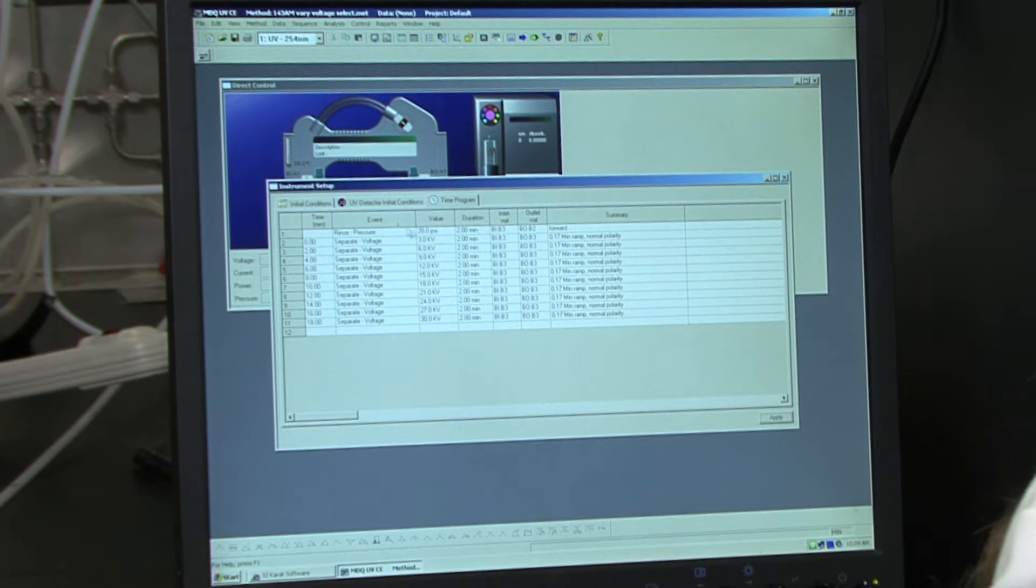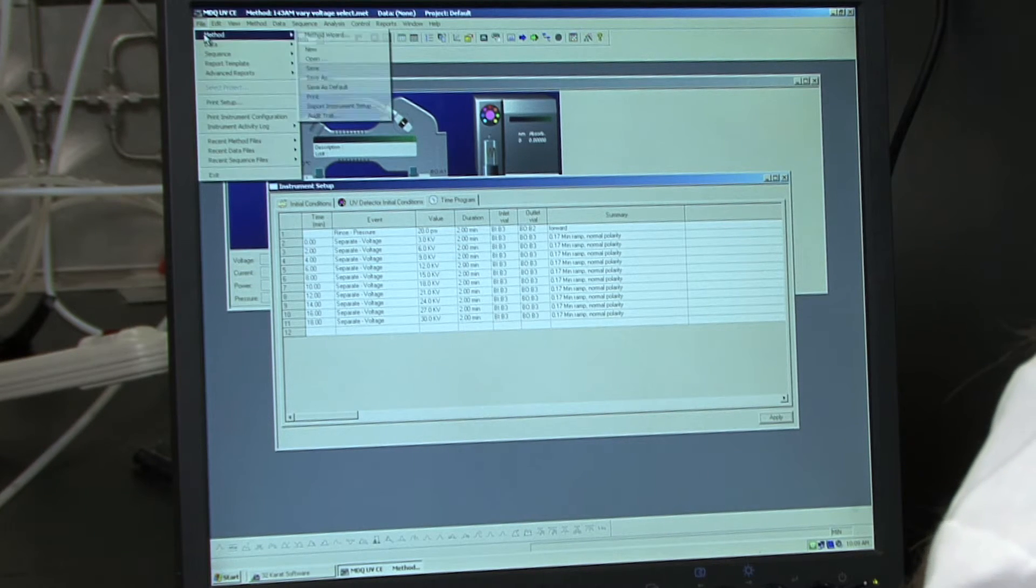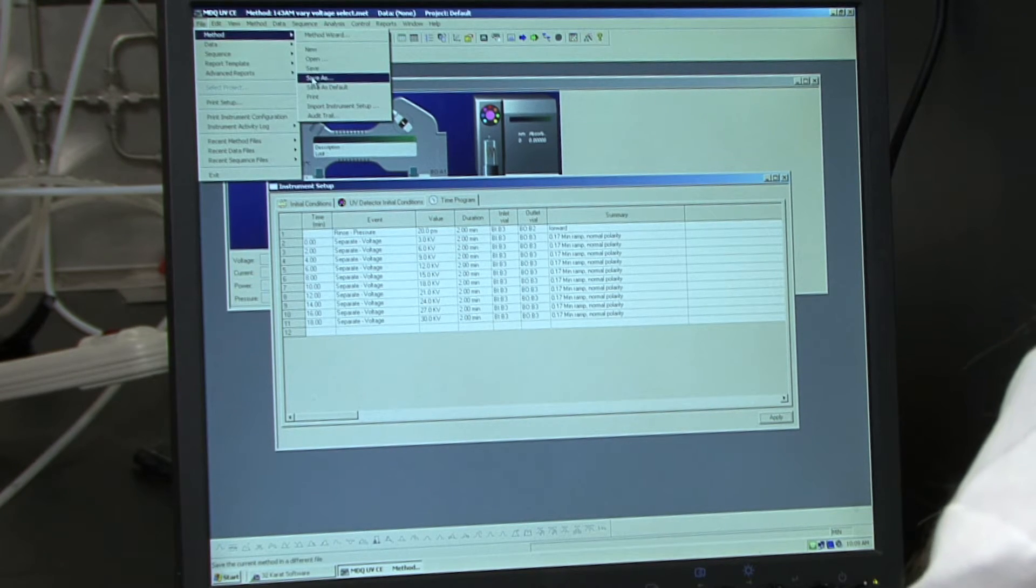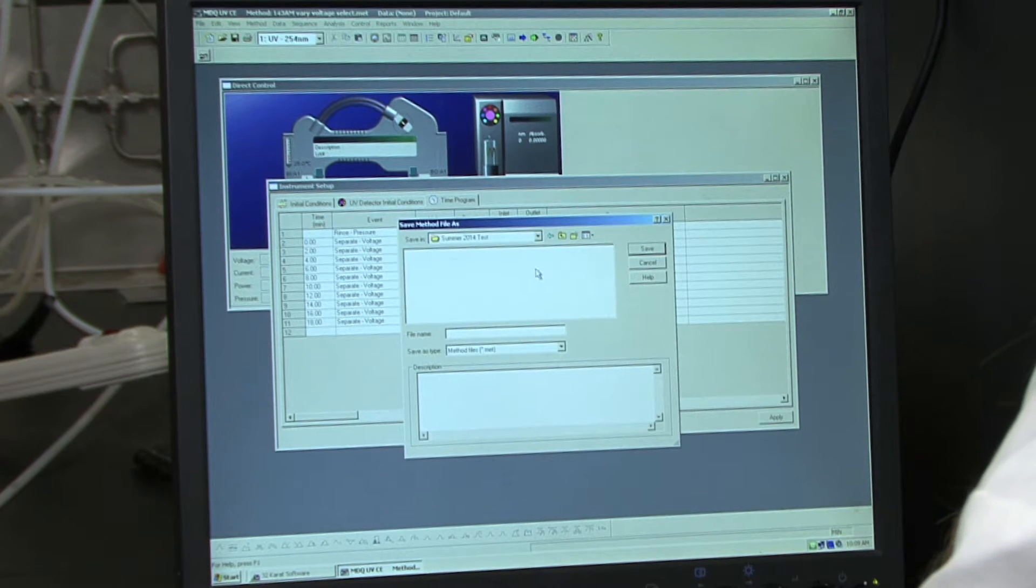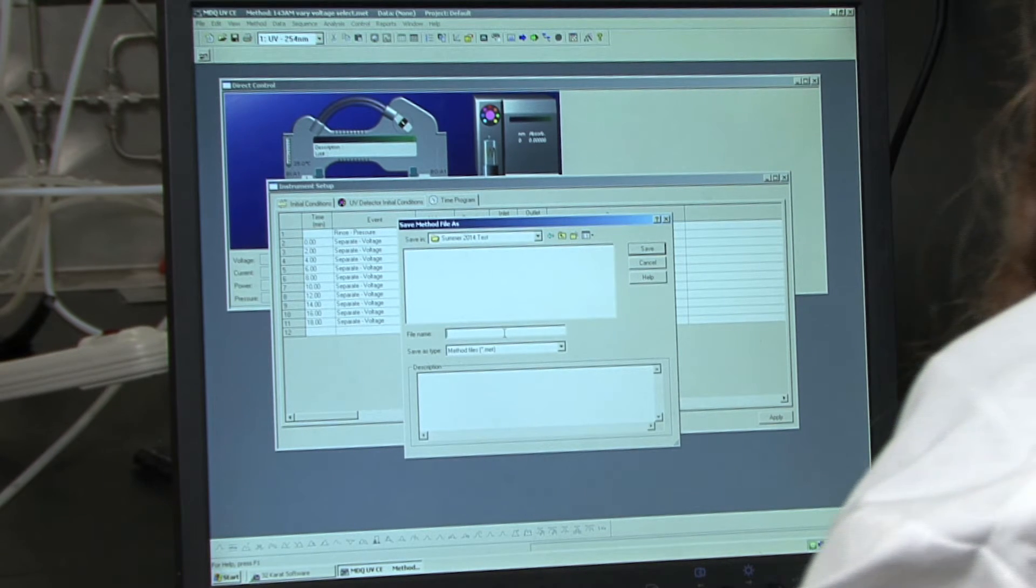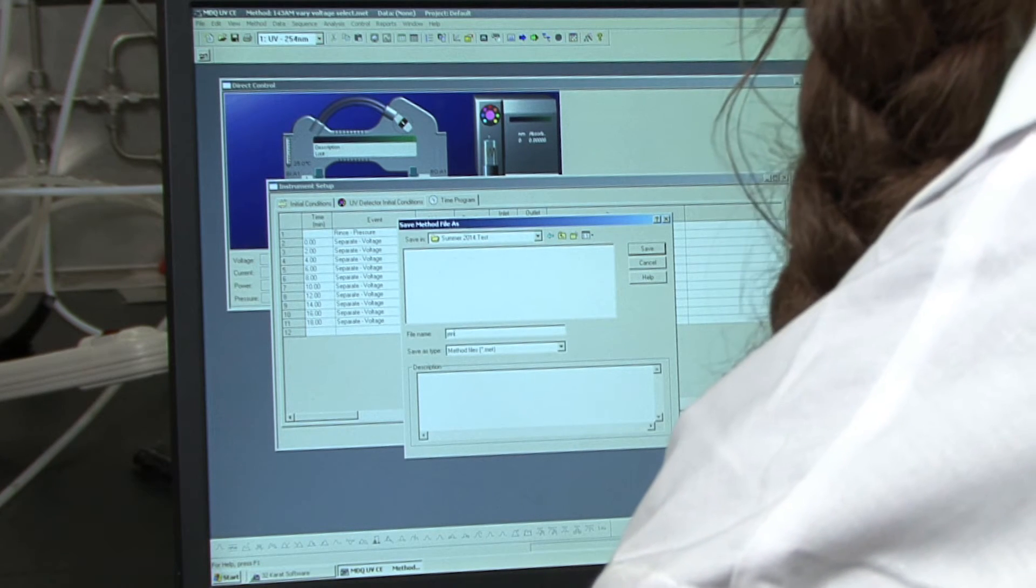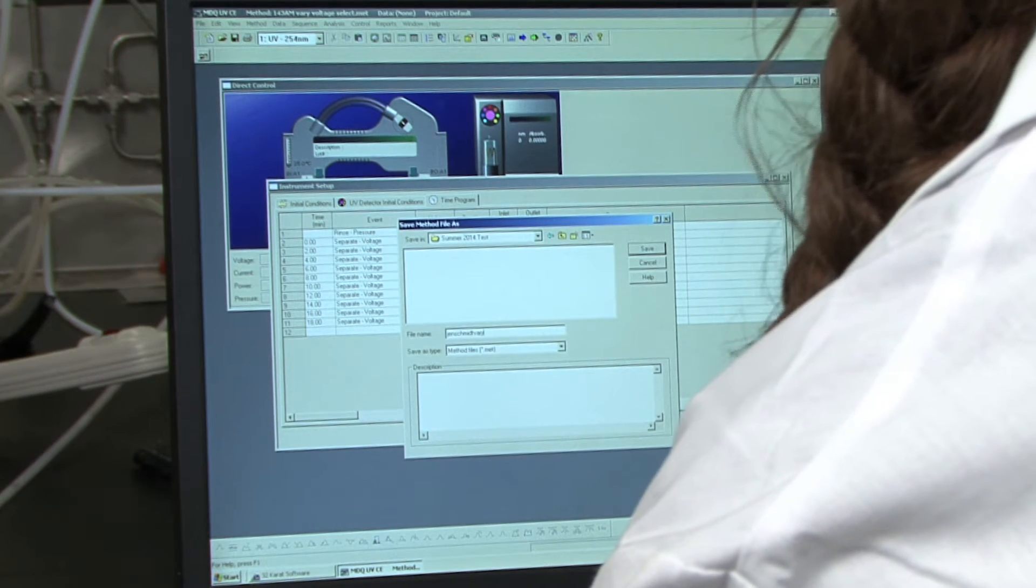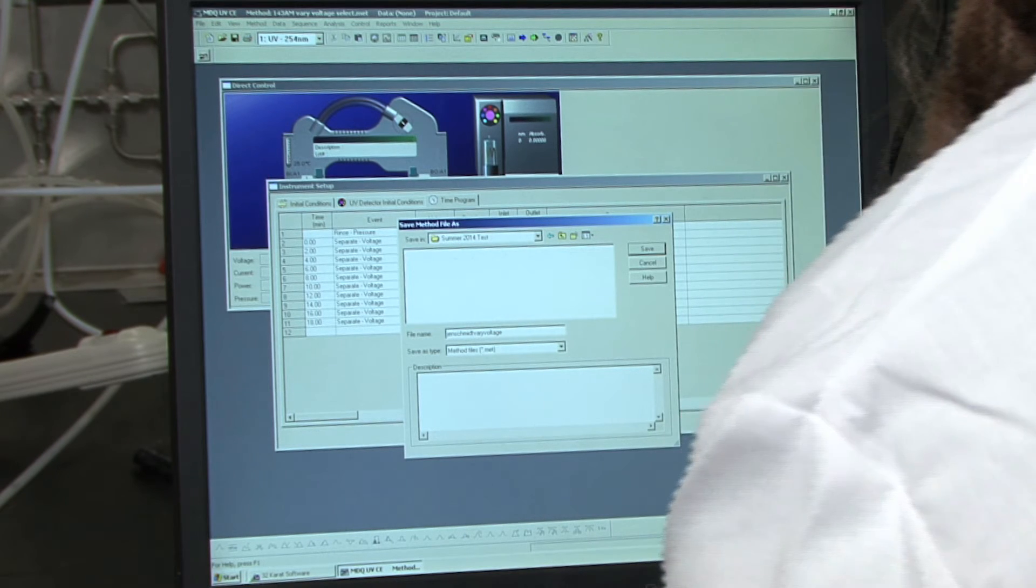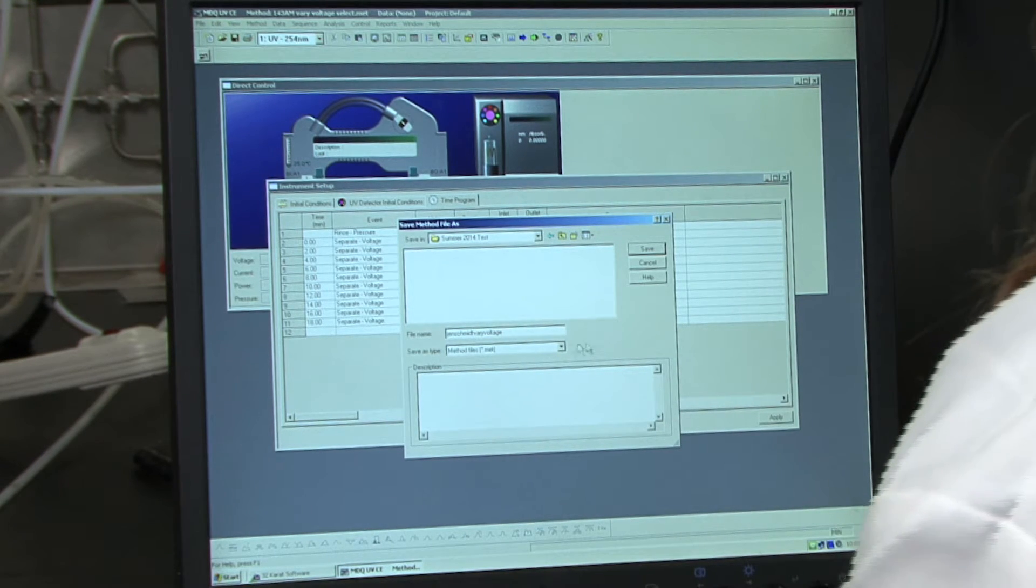And now I want to save the method. So I'm going to go to file, method, save as. And I'm going to save it in a folder. You're going to save it with your Hawk ID and then variable voltage. And just double check that you are saving this as a method file.